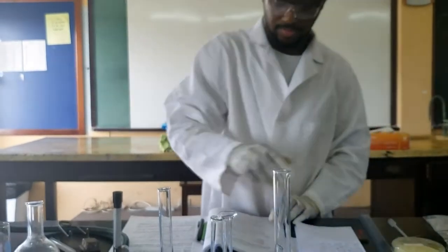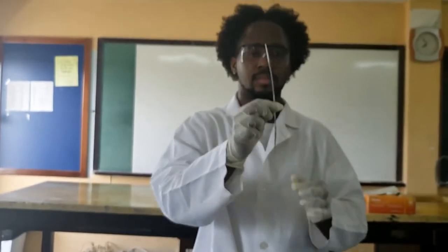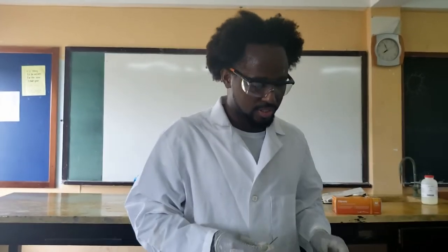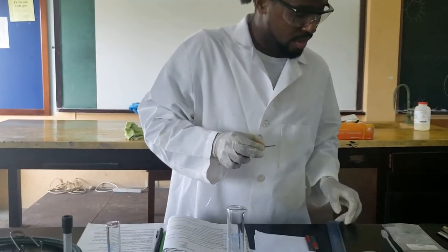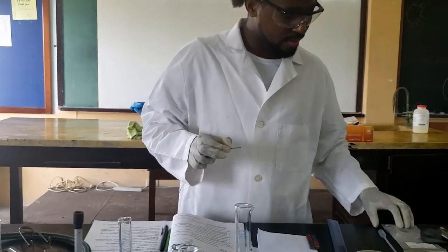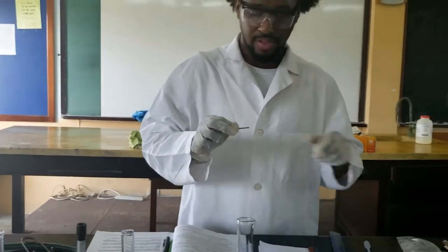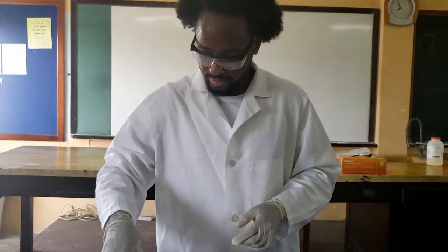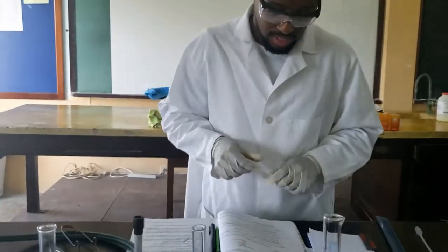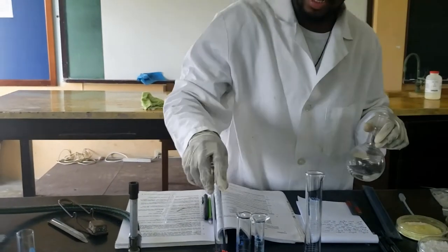Experiment number two. We have magnesium ribbon — it comes as a silver piece of metal; we want two centimeters of that. So we just measure about two centimeters of magnesium ribbon. We already cleaned it with sandpaper. If you notice the way it comes, sometimes it forms an oxide layer, so we want to remove that oxide layer first. Then we can just pinch and break off a two centimeter piece. Then we want to get four mLs of hydrochloric acid, so we use a 10 mL measuring cylinder with a clean pipette.